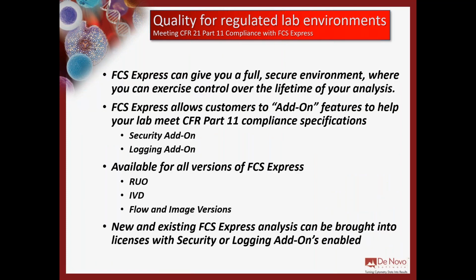So with FCS Express, we can give you a full secure environment where you can exercise control over the lifetime of your analysis. FCS Express allows customers to add add-on functionality to the software to help you meet CFR Part 11 compliance specifications. And we offer these in the form of the security add-on and the logging add-on. Now, importantly, these functionalities can be added to all versions of FCS Express.